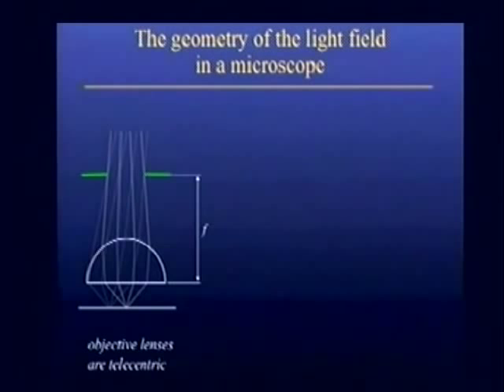So what happens if you block out that ray? Look at the centroids of the cones now. The cones are the same shape. Their centroids are parallel. So what does it mean for the centroids to be parallel? There is no point of perspective in a microscope. It's not a perspective device. It's an orthographic device. So if you go to any textbook on microscopy, you won't see the word orthographic written in the textbook. This is something we computer graphics people might think about.